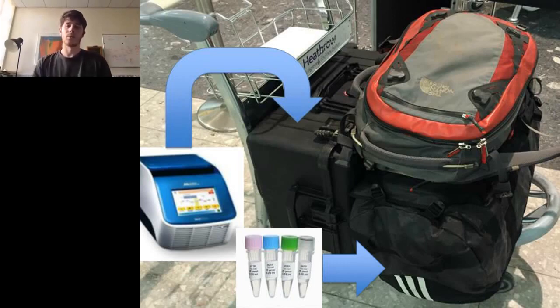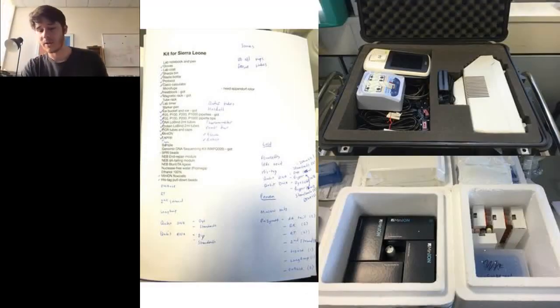So what else do we need to include in our mobile lab? Well, I'm going to talk about how we sequenced Ebola first of all. We decided that the simplest way to try and sequence Ebola would be to use an old technology called PCR, the polymerase chain reaction. And this is the equipment that we took with us.